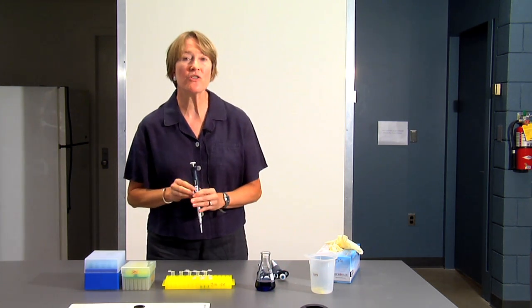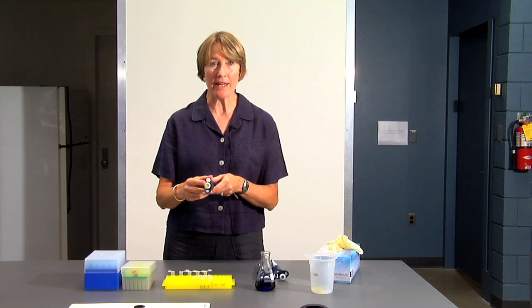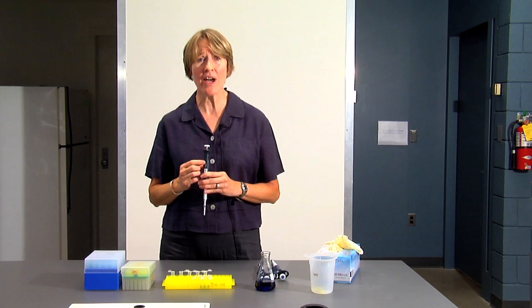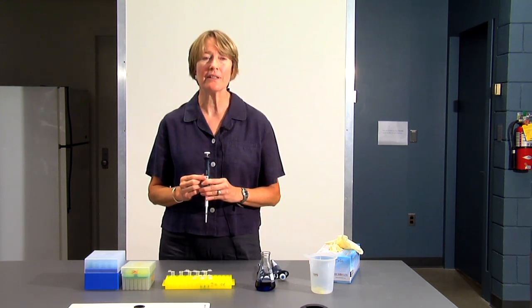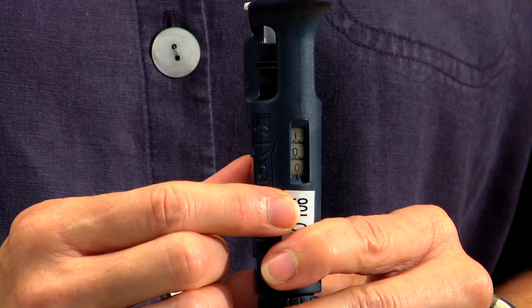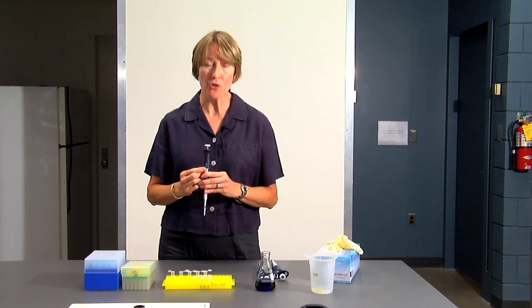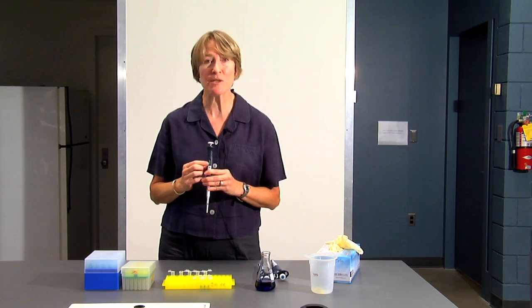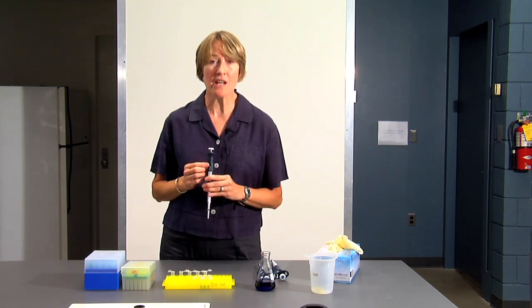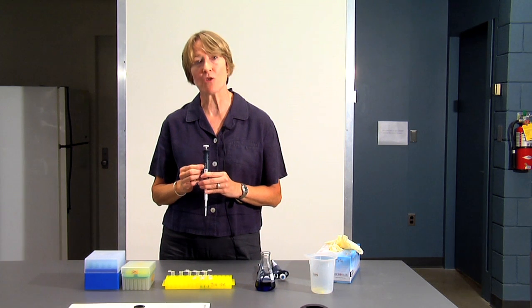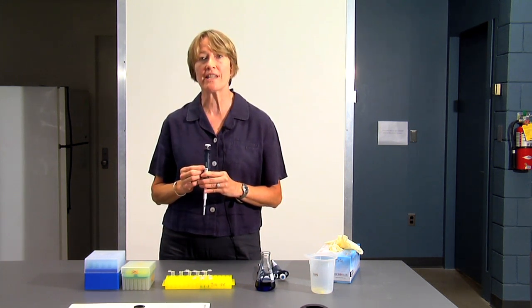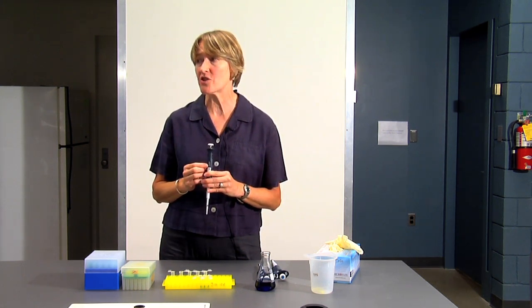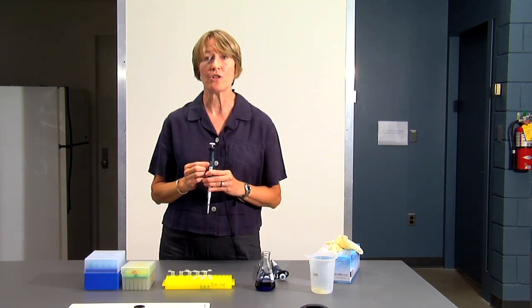The third pipette that we'll be using is the P20, which measures accurately 2 microliters to 20 microliters. This also has three numbers on the barrel, but notice that the bottom number is in red. That is an alert that tells you that bottom number is tenths. So there's a decimal point before that number. So if the dial reads 100, that stands for 10.0 or 10 microliters. If you wanted to measure 2 microliters, you'd set the dial on 020.